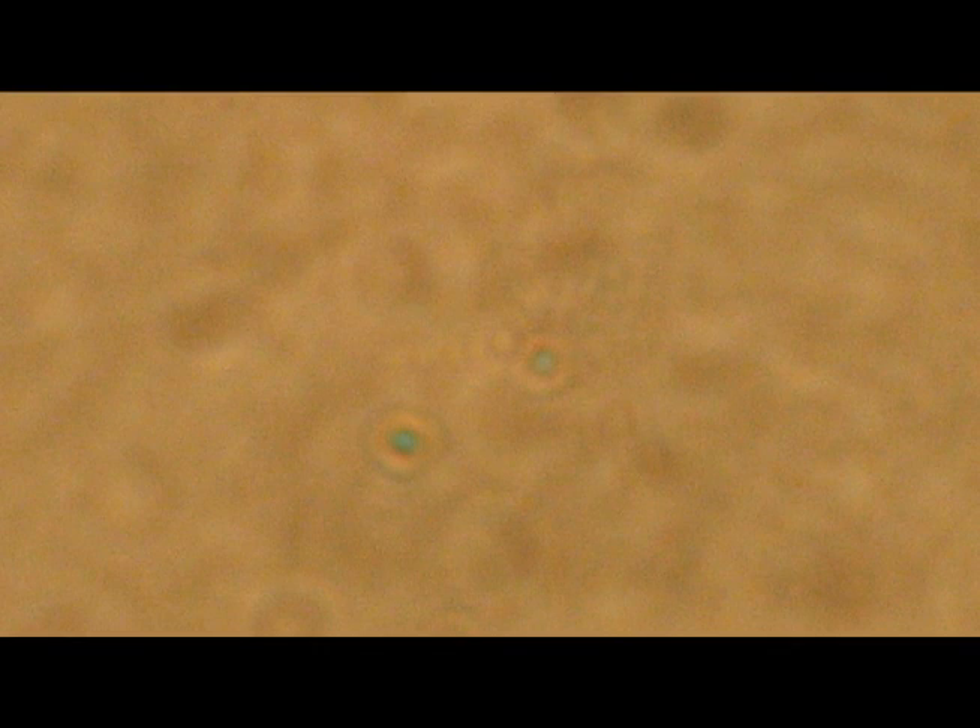After blot drying the slide with bibulous paper, examine under oil immersion. Seen here are two spores. They may be difficult to identify as they are very small.